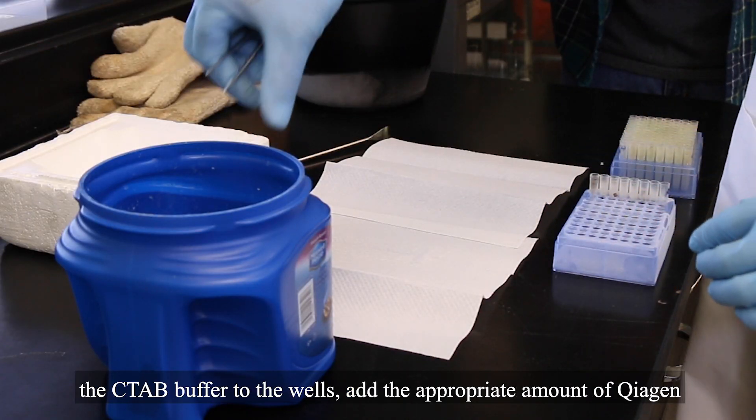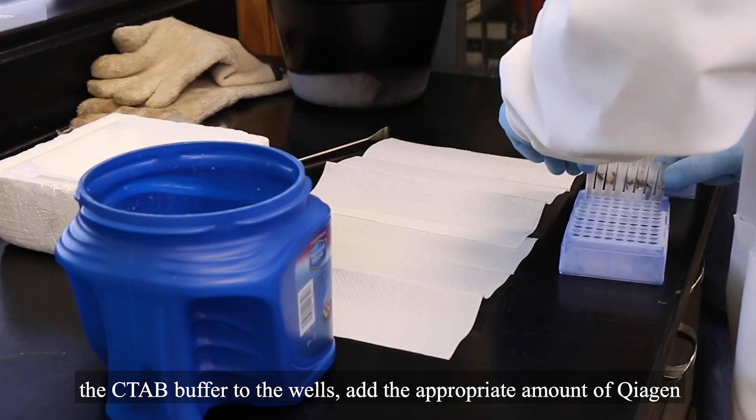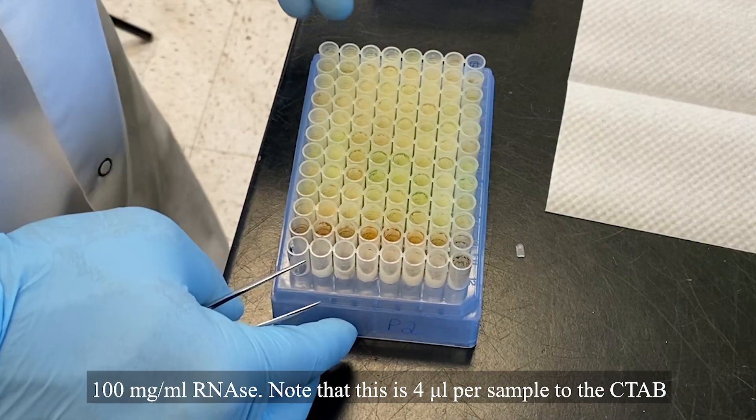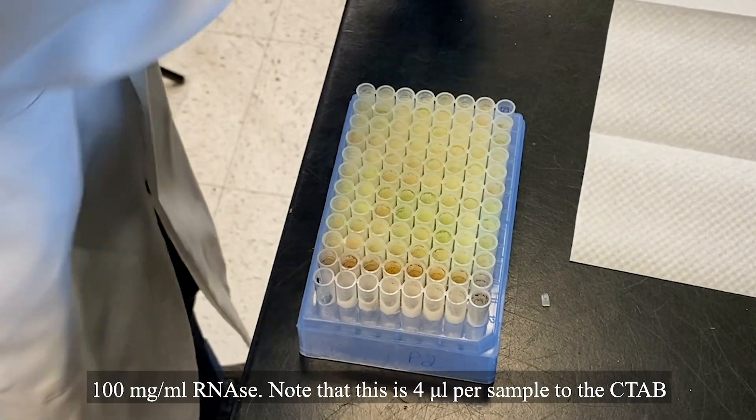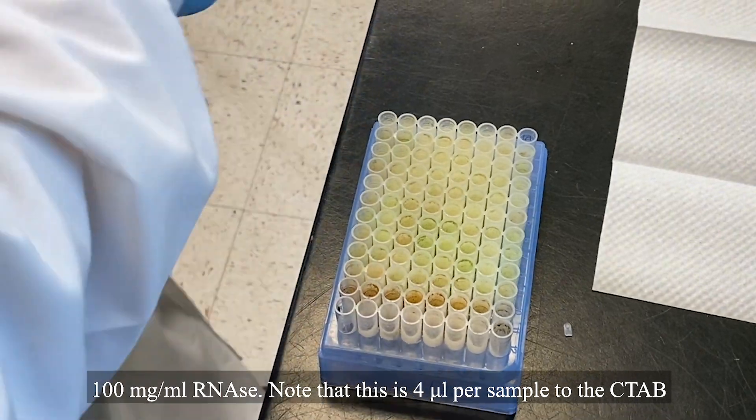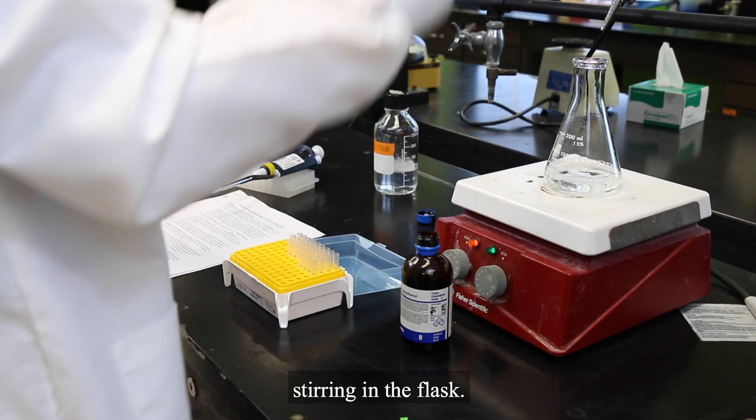just before you add the CTAB buffer to the wells, add the appropriate amount of Qiagen 100 milligrams per mil RNase. Note that this is 4 microliters per sample to the CTAB stirring in the flask.